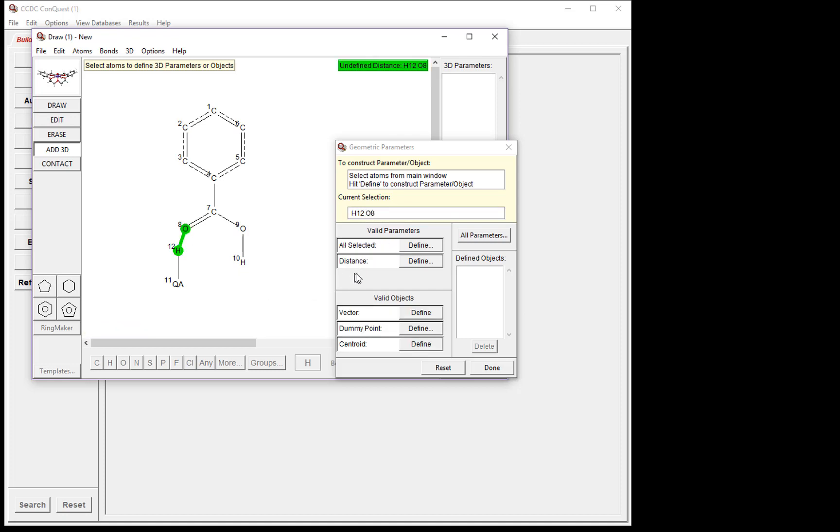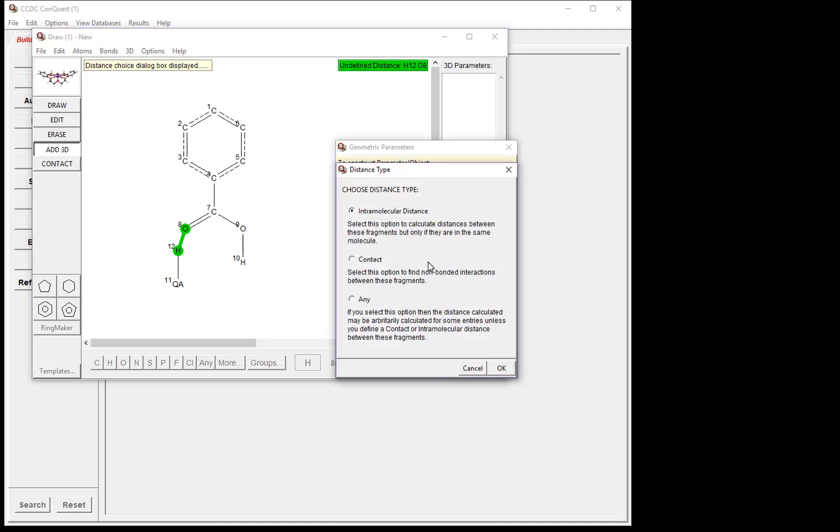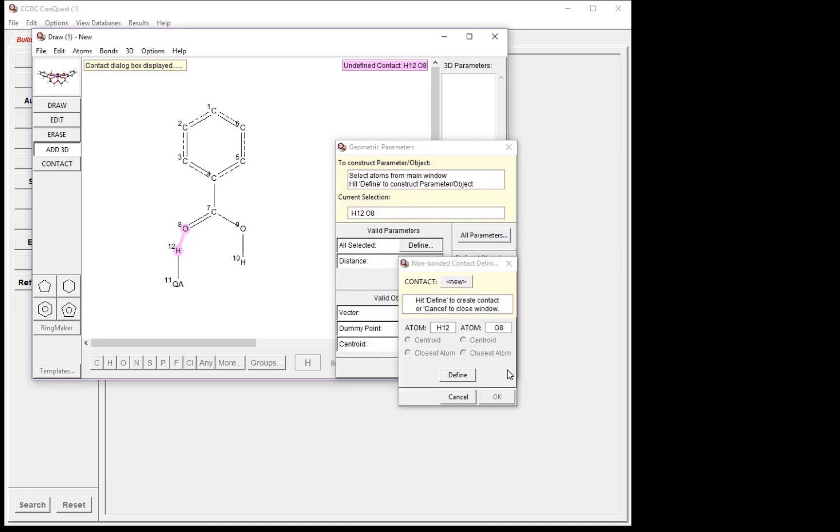Here in the geometric parameters window, you see Distance. We want to define this distance, so we click Define. Now it asks us to choose a distance type. Since this is an intermolecular interaction, we want to select Contact. Tick the box next to Contact and then select OK.